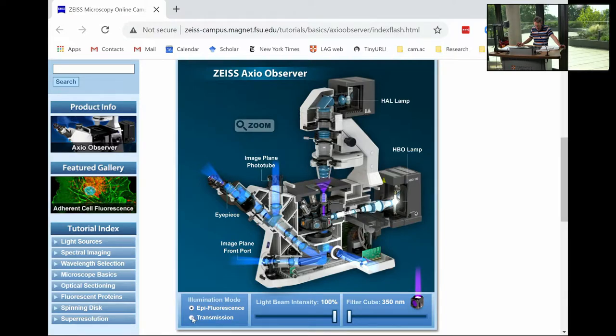So I'll switch over in this microscope, so you can see that this light path is coming on. Let me just play with the light intensity here. I can adjust that, so you can see bits are lighting up in different ways. So let's make it bright, so you can see what's going on. The light source is imaged through the condenser lens onto the sample. The sample sits here on this stage. You can move it left, right, and up and down to get the sample into focus.